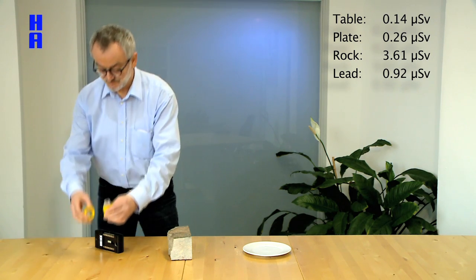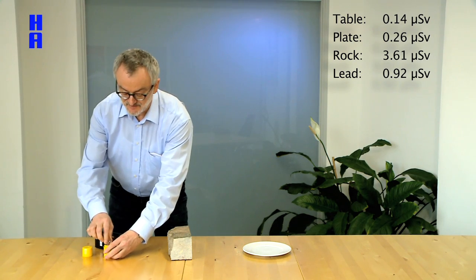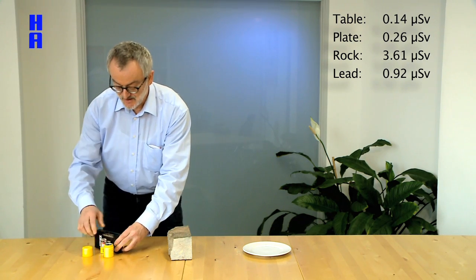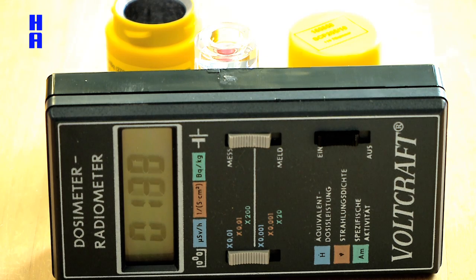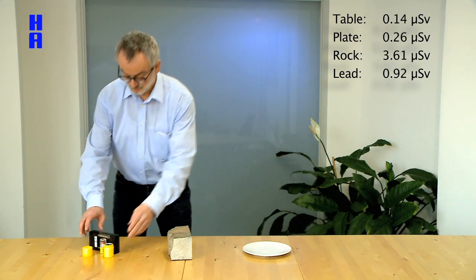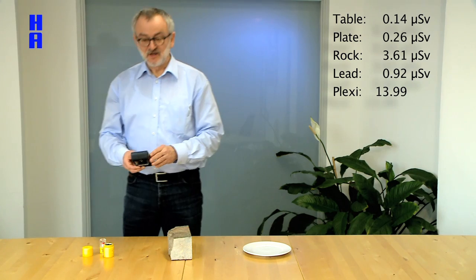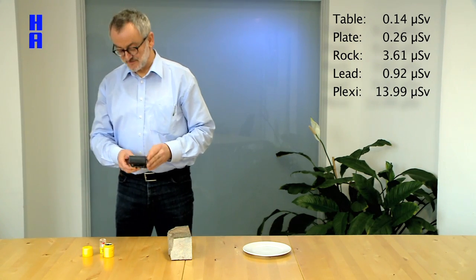And if I open this, put it aside and take the inner plexiglass vial and measure that one, we will see what the value will be there. The reading here is 13.99 µSv.